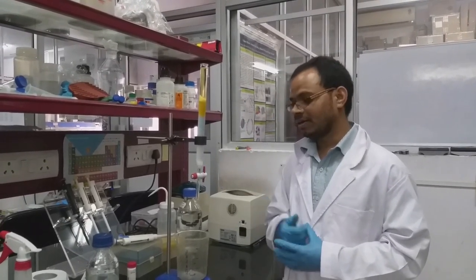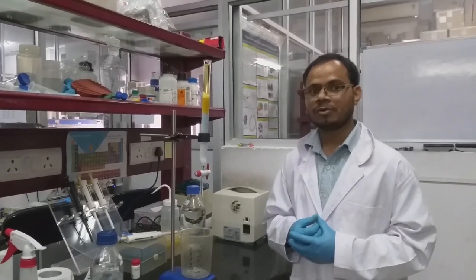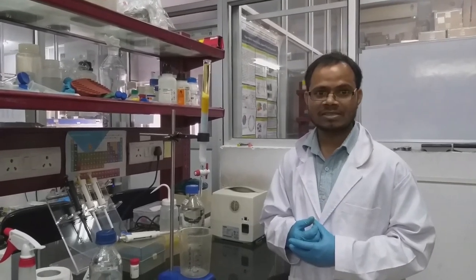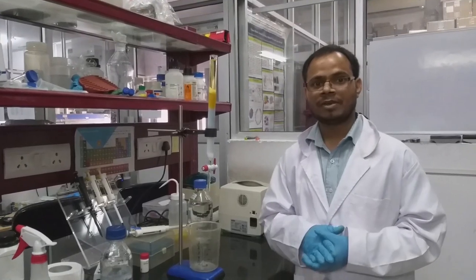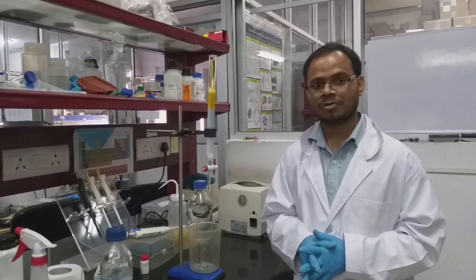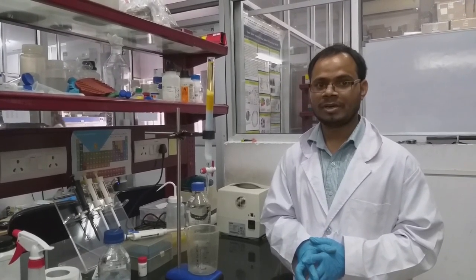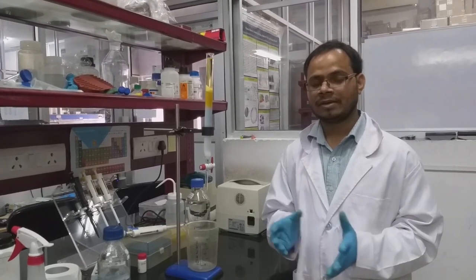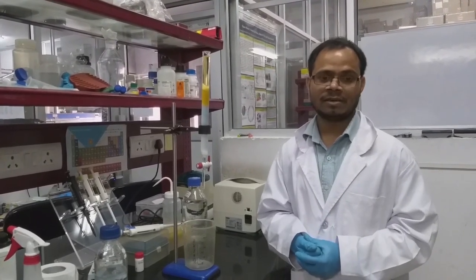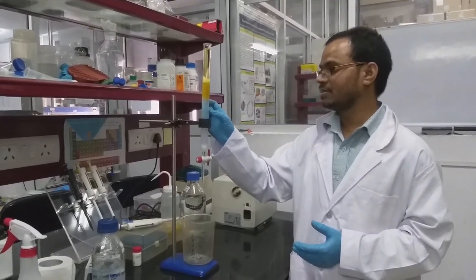But after collecting, how do you know these proteins are of their corresponding molecular weights? So what you have to do is collect all the fractions, and you can verify through polyacrylamide gel electrophoresis, or you can check with a UV visible spectrometer based on the protein absorption spectra. So we can clearly see it is eluting out.